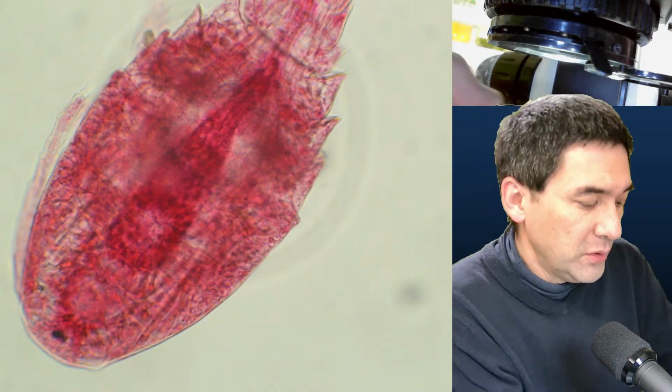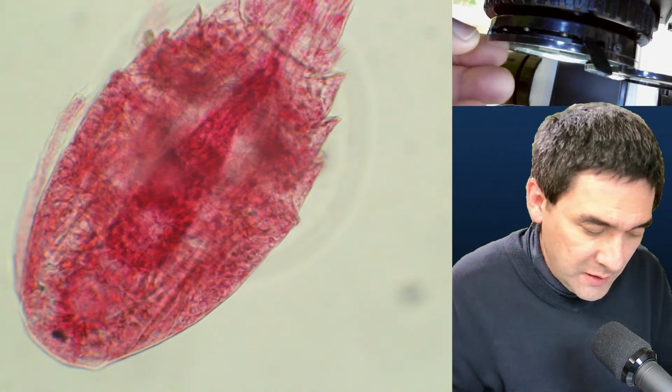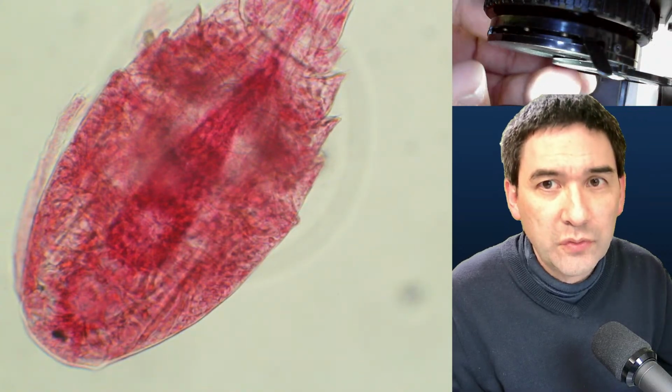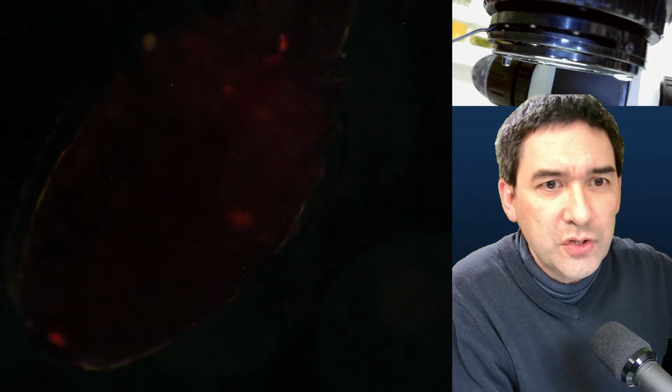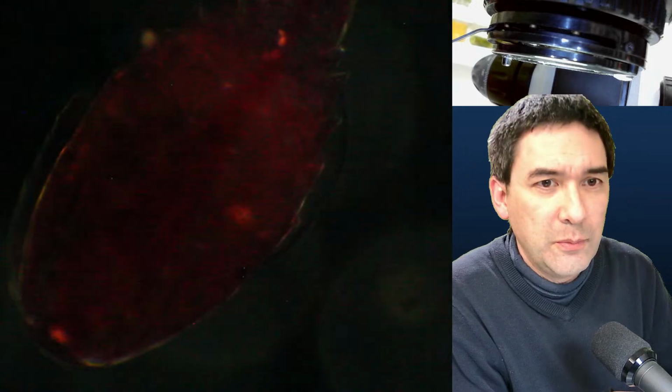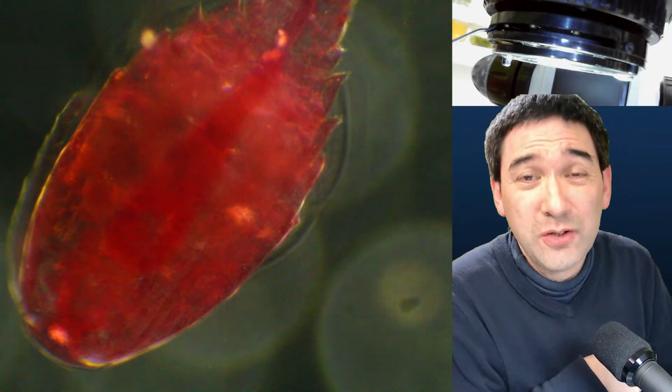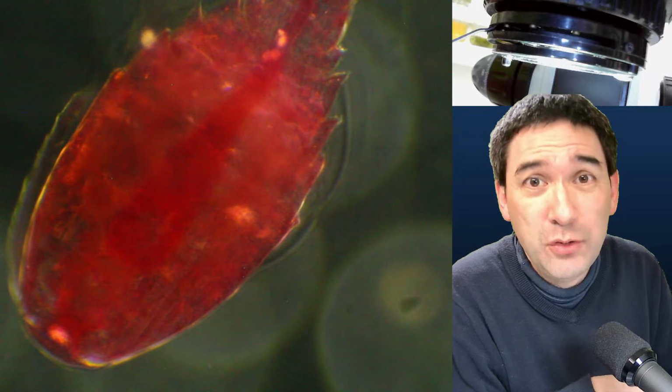Now let's try to see how this looks like with a dark field filter in place. Okay, so I'm going to rotate this in. I'm going to open the condenser, and what do we see? Nothing. Okay, so I'm actually going to, I hope I'm turning this into the correct direction now. Okay, and let's go up with light intensity. Yeah, so that's how it looks like, and it's not really very interesting or nice.